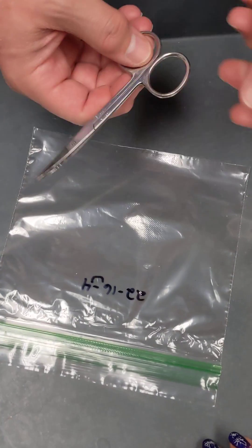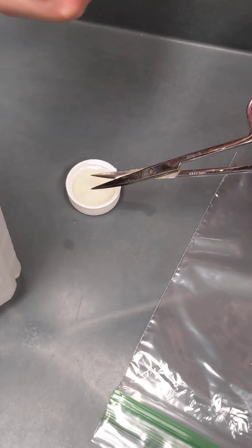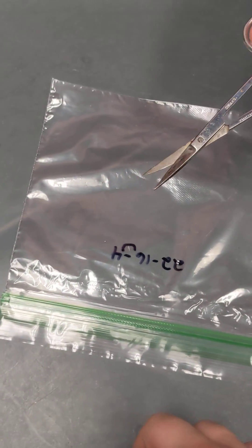And then if you're going to do more animals after that, just have normal rubbing alcohol from the drugstore. Put your tip in, flame it, and you're good to go for the next one. That's it.